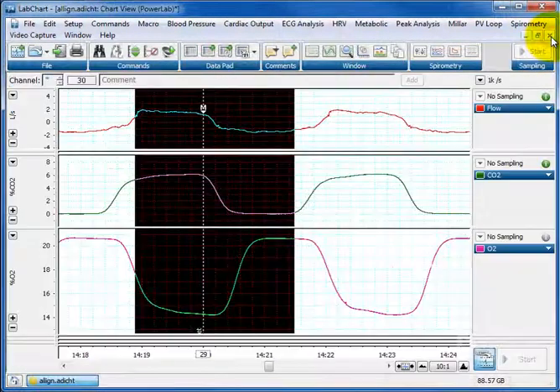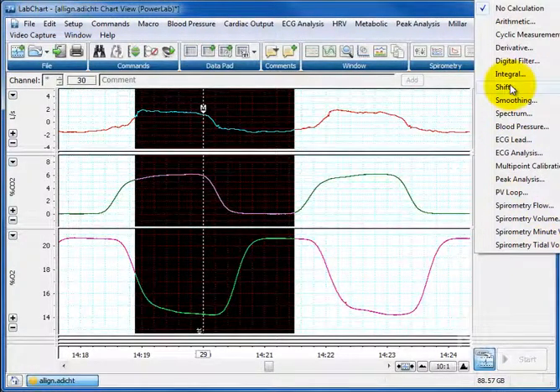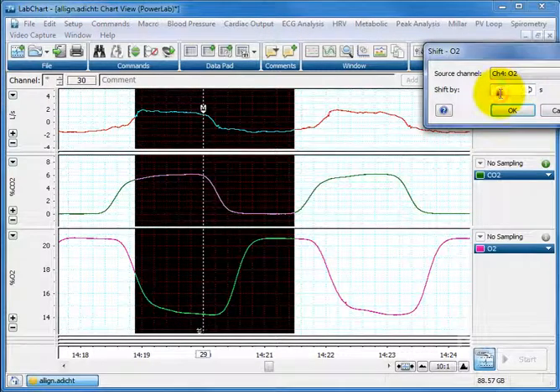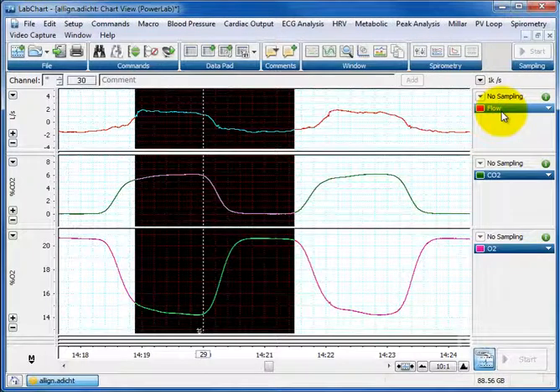I use the drop down window of the O2 and I choose the word shift. I then type in minus 0.254 seconds and press go, and you can see immediately on the screen it has shifted the O2.